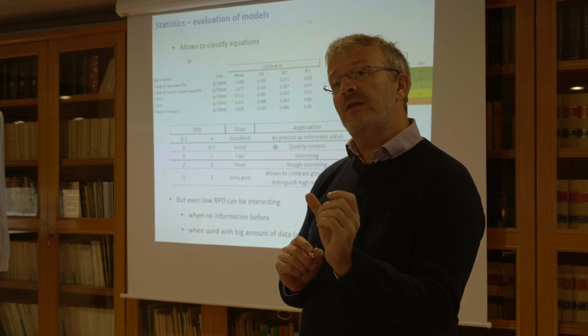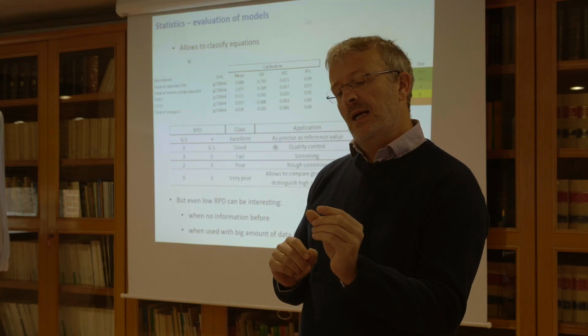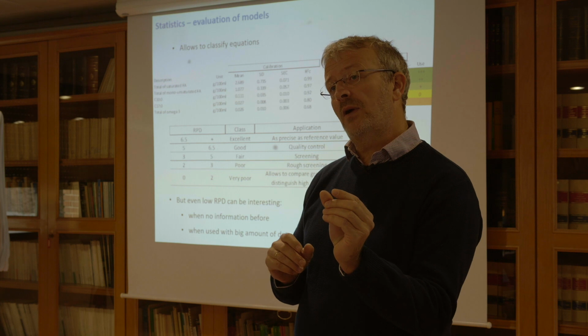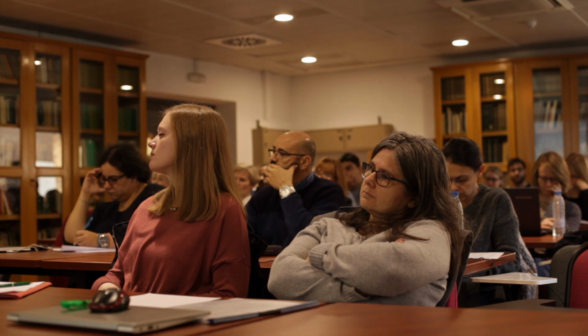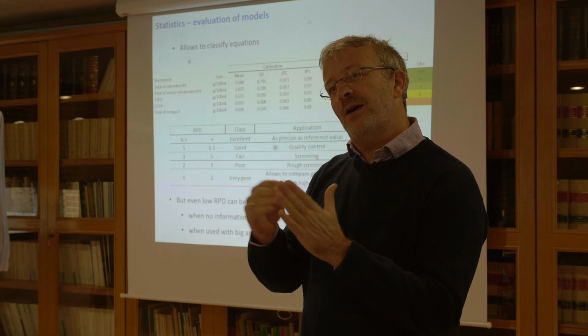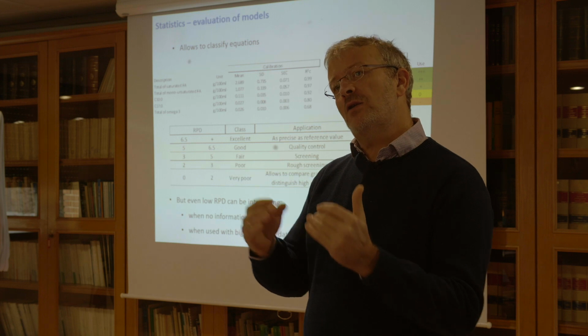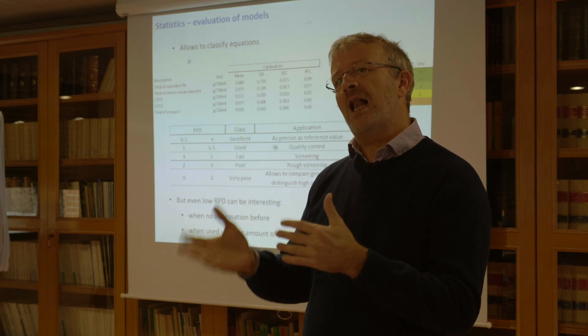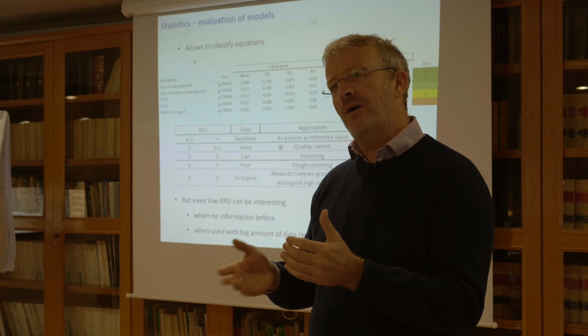But for the near infrared, as you have more energy in your waves, you are able to measure larger samples. For example, we have cells of around 1 centimeter. It can be used for the solid, and it helps us to measure these solid samples. Also, there is the interaction of the water, which doesn't help the near infrared. You can retain this: in general, you need to have samples without water by using the near infrared.